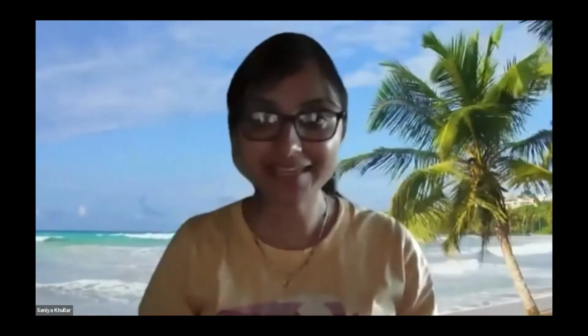Hi there, I am Saniya, and in this video, I'm going to be talking to you guys about how you can go from a SNP ID, single nucleotide polymorphism, like one DNA base pair difference that's commonly found in at least 1% of the population around the world. How you can go from a single nucleotide polymorphism, either the rsID or the chromosome number and the location, to figuring out the minor allele frequency for that SNP. So how can you figure out that information?